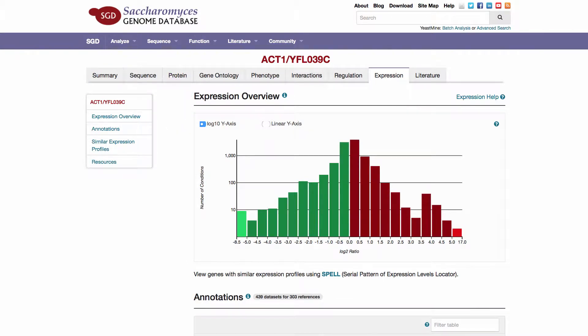Expression data are primarily derived from records deposited in GEO. Dual channel data are loaded as log2 ratios of the experimental condition relative to the control. Data from single channel arrays are normalized using the average expression for each gene across all conditions.